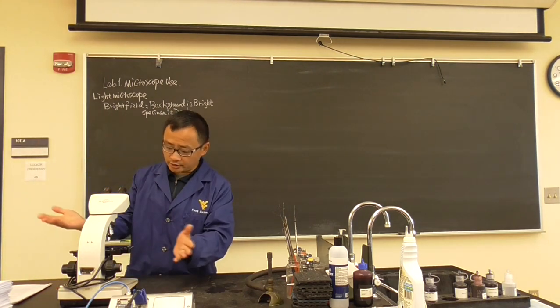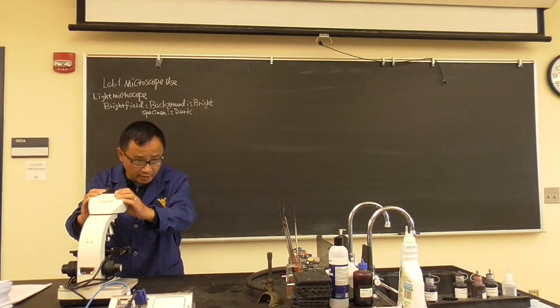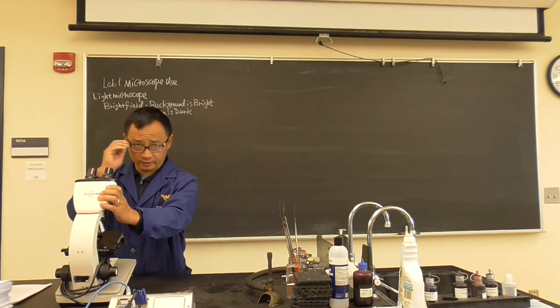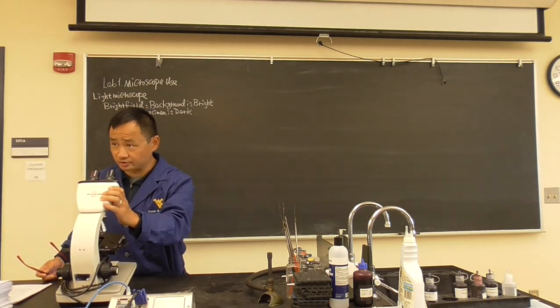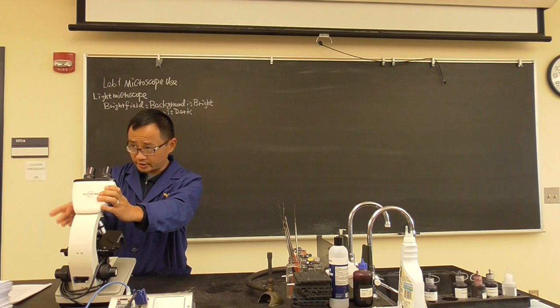Second, we want to talk a little bit about the structure of the microscope. So the first question is always, what is the most expensive part of a microscope? It is the lens. So we have two kinds of lens. One is on the top, so your eye can go there to see, close to your eye. That's called the ocular lens. And you have some switch right here. You can change it to 4x, 10x, 40x, and 100x. These we call the objective lens.